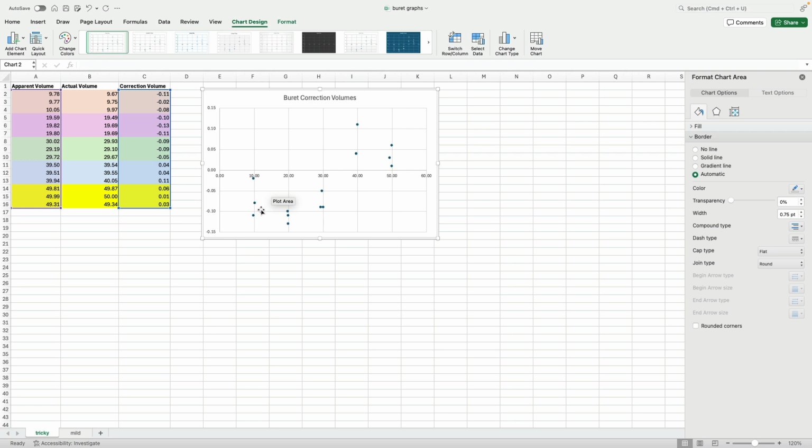So what you need to do is start going through segment by segment. So going from 10 to 20. If you just pick whatever the middle points are on each of those, you can see this goes from here to here. It looks like it's going down. This looks like it's going up and down. Would this part right here be linear?